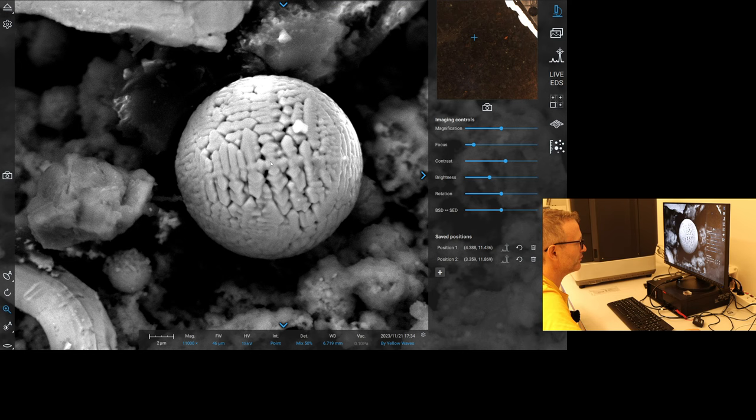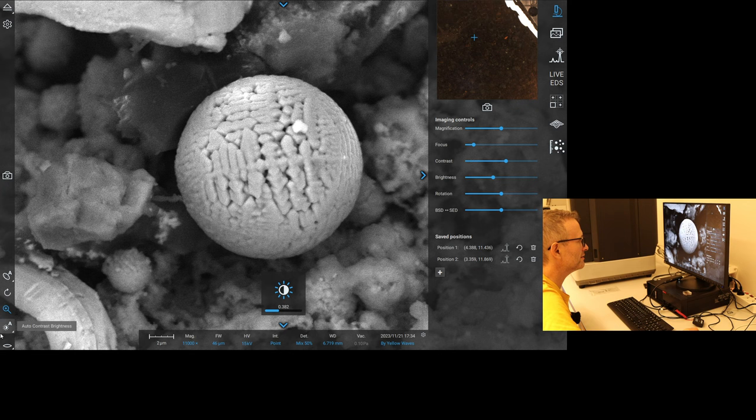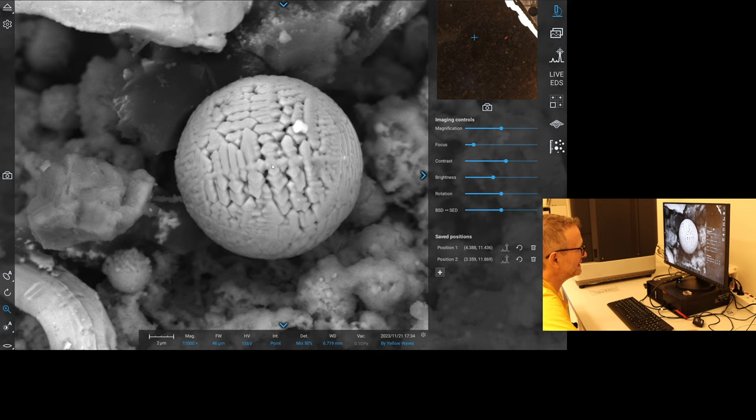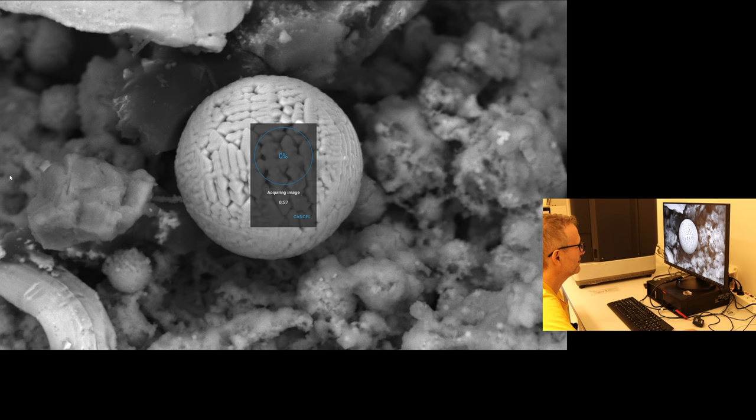And maybe this is the North Pole. Yeah? And maybe now it will be okay with just sitting there. Interesting. Is it going to move? Still moving. Are we going to make it jump? Okay, I'm going to... No. Yeah, it's moved less. I think it's directly aligned with the electron beam. That's interesting. I think we'll take this shot, and then we'll lower the beam energy and maybe it won't rotate so much. But does that mean we're looking directly at the north or the south pole? What do you think?